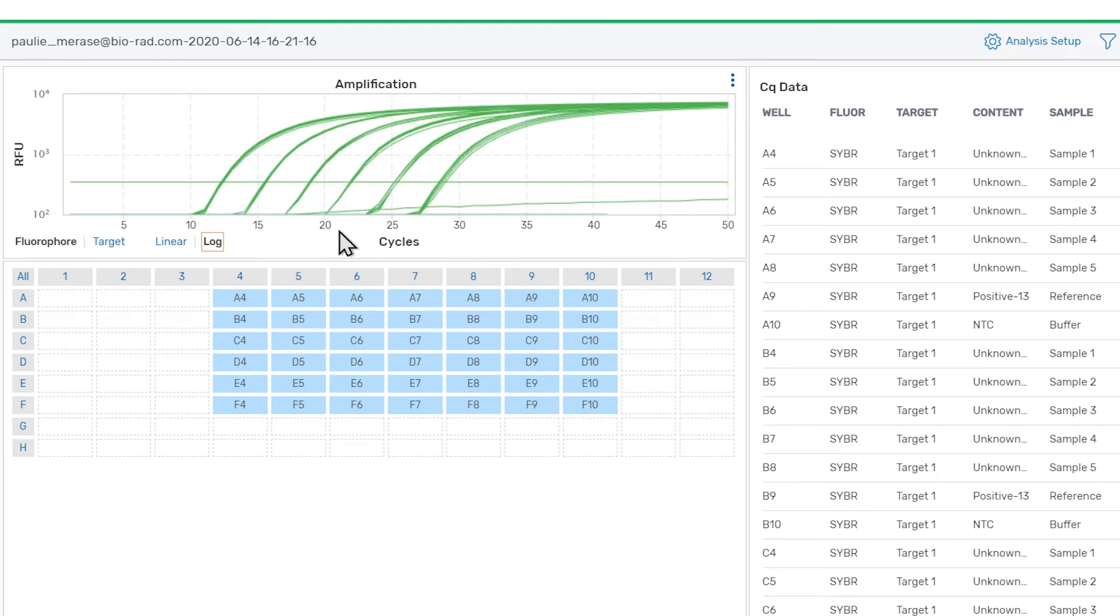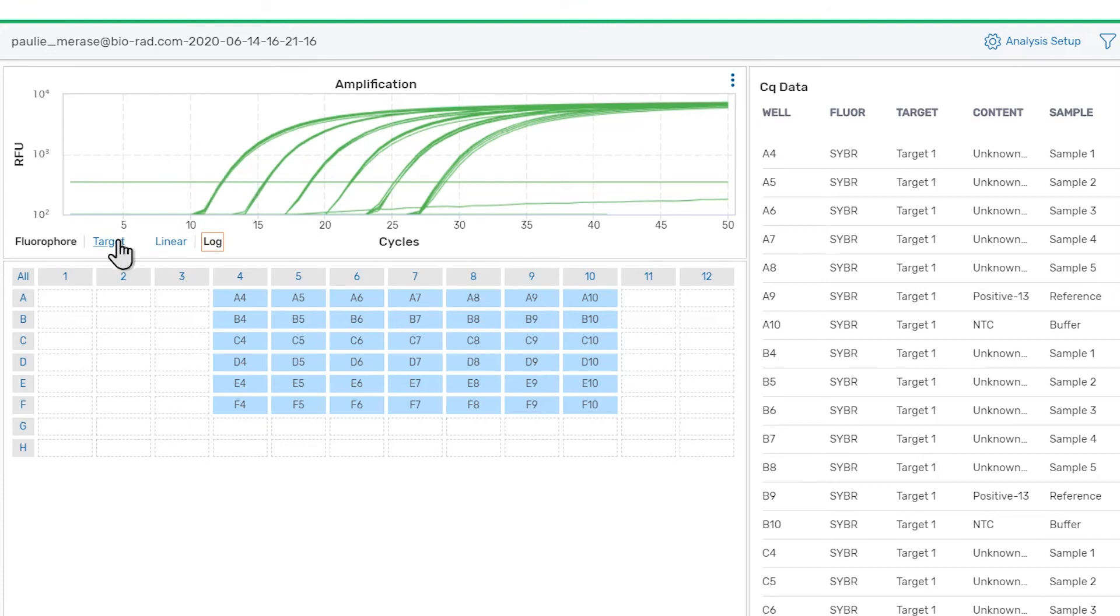Thresholds for determining CQ values are automatically determined and applied on a per fluorophore basis. Thresholds can alternatively be calculated on a per target basis by clicking the target toggle in the corner of the amplification chart.